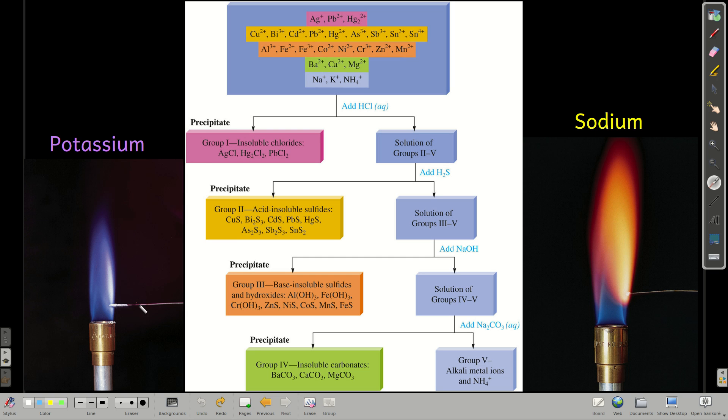You can also test for potassium. If you do the same test back up here and when you put it into the flame, you see a purplish flame, violet I guess, that's the indication that you have potassium.